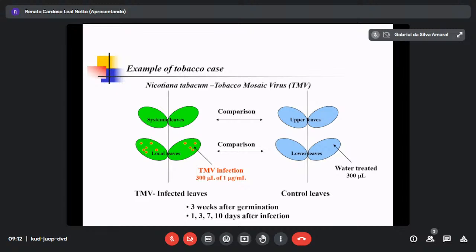But in NMR cases usually there is a value for everything, but in mass spectrometry cases many zero values come out. Zero values are missing values. But you have to think about it.